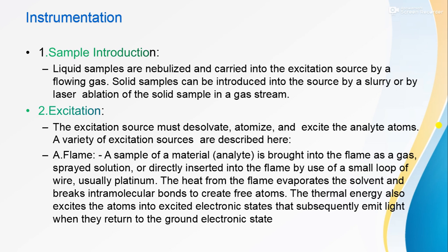A. Flame. A sample of a material, the analyte, is brought into the flame as a gas, sprayed solution, or directly inserted into the flame by use of a small loop of wire, usually platinum. The heat from the flame evaporates the solvent and breaks intramolecular bonds to create free atoms. The thermal energy also excites the atoms into excited electronic states that subsequently emit light when they return to the ground electronic state.